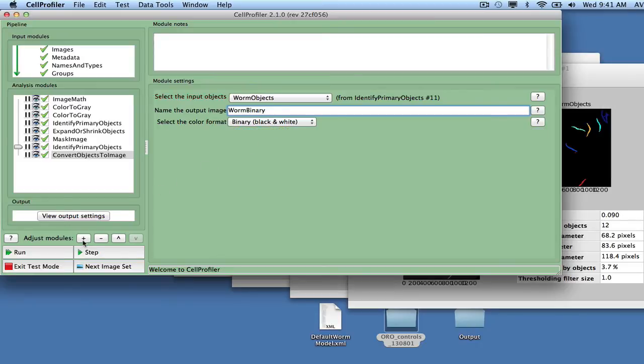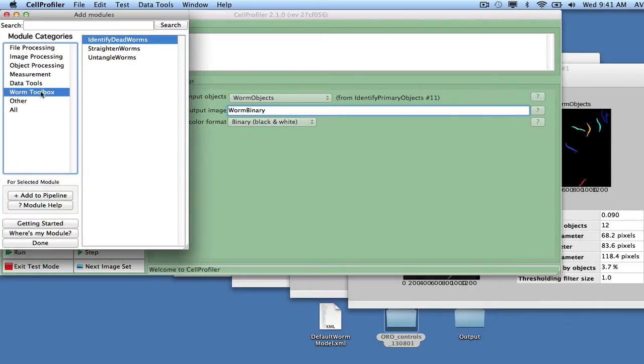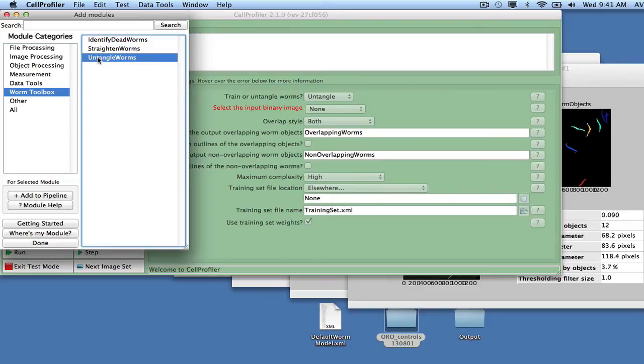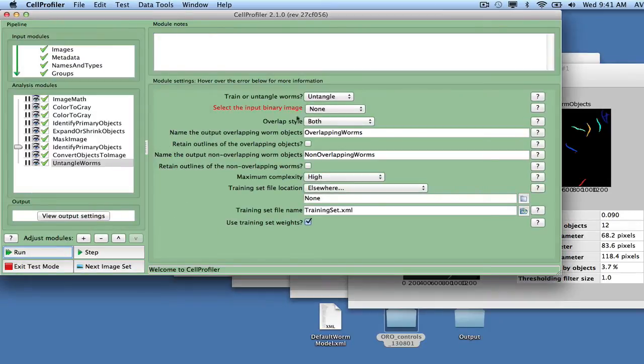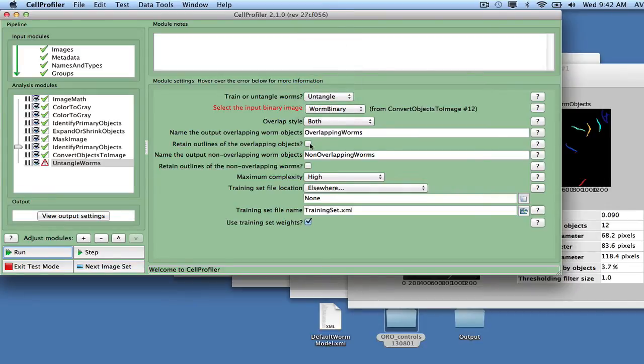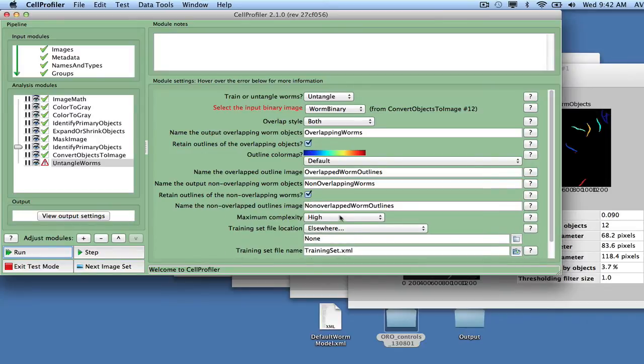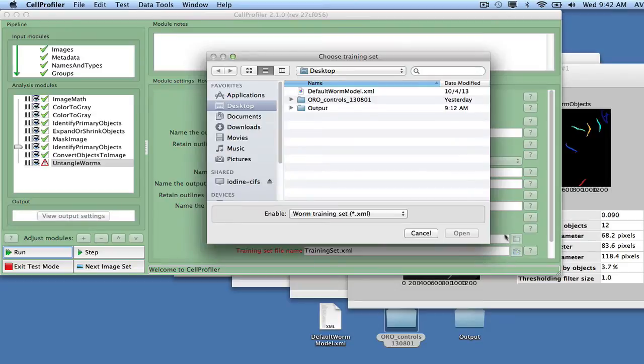Add the module Untangle Worms from the Worm Toolbox. Set it to untangle using the worm binary as input and choose both as the overlapping style. This sets the module to work with overlapping worms when measuring size and shape, but not overlapping worms when measuring intensity. Click the box for retaining both kinds of outlines and set the training set file name to the default worm model.xml file.